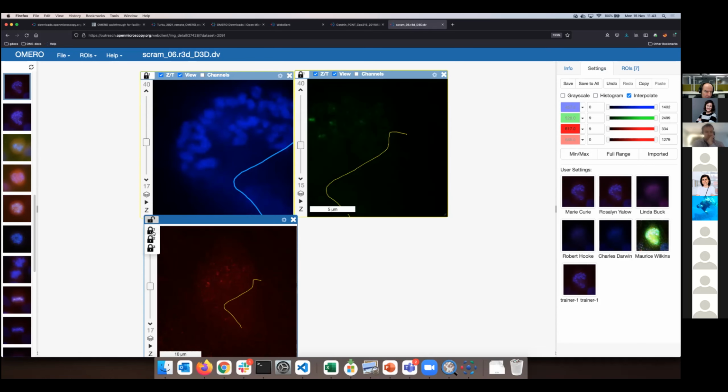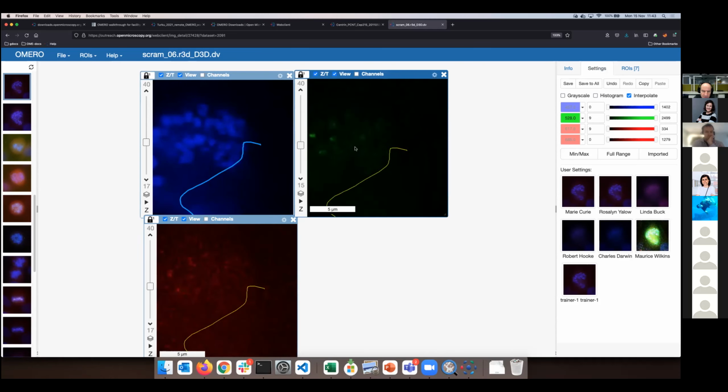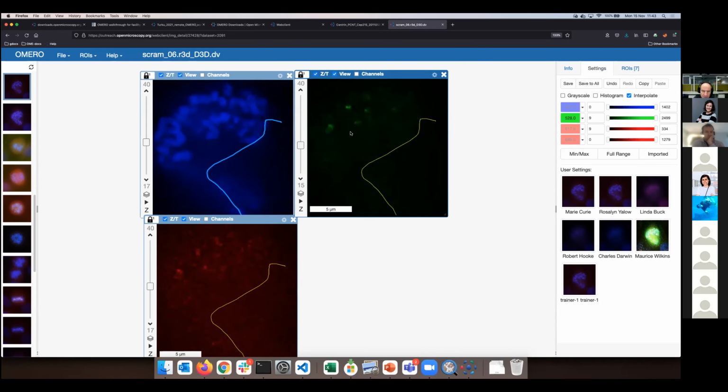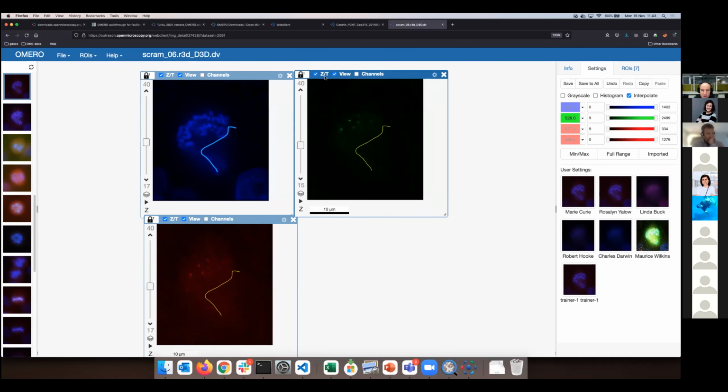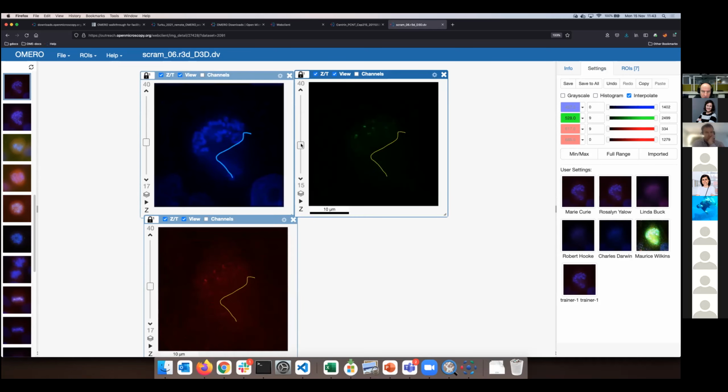Like that, I put all 3 viewers into the same synchronization group. And when I do the next action, like panning, then the viewers start to get synchronized. And so it is when I scroll, and what is synchronized is highlighted here on the top bar, as well as I can now scroll through Z, and this is synchronized as well. Can you see that? Okay. So this is the multi-view synchronization view.